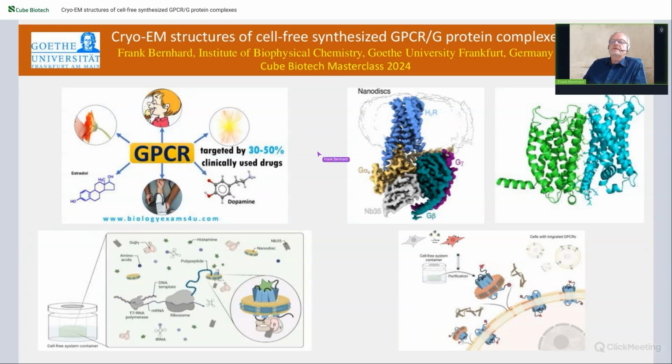I'm talking today about GPCRs, which, as already mentioned, are an important and large class of eukaryotic membrane receptors, sensing taste, smell, and a large heterogeneous class of hormones, small molecules, and others. And this group is interesting for the pharmaceutical industry, and I'm talking only about members of that group.